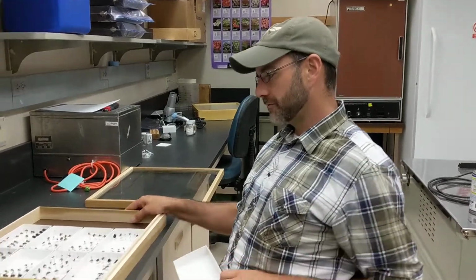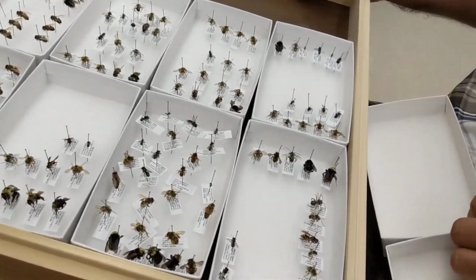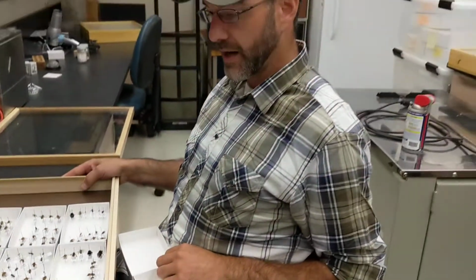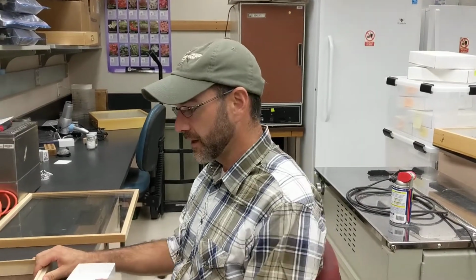We have a bunch of random prepped material here, pinned and labeled appropriately. So what I'm going to do is just show you how to sort your material to morphospecies groups.